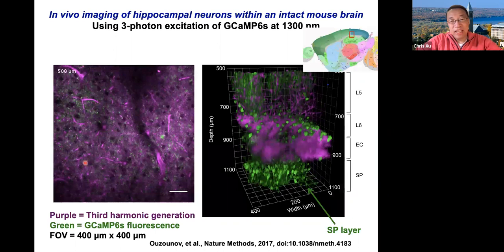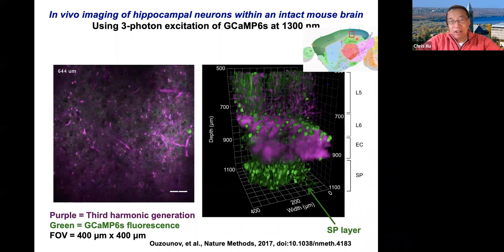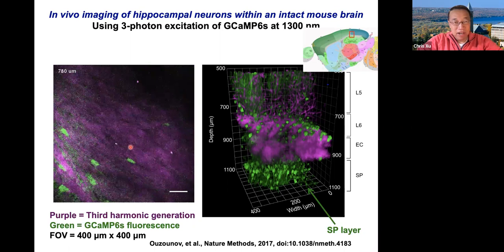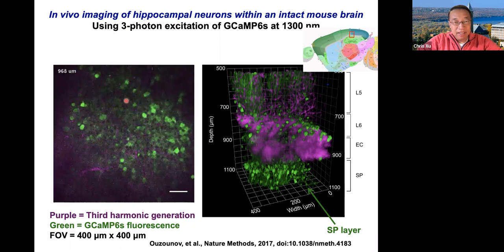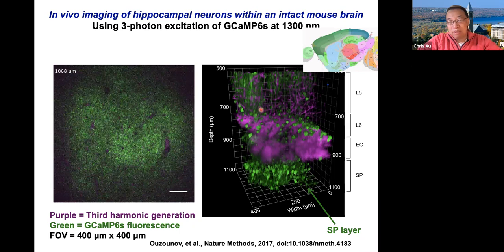Now we can do wonderful things once you can go deep with the long wavelength and three-photon approach. For example, here we image all the way through the cortical column, through the white matter, and all the way to the hippocampus of a mouse brain. You can see the white matter going by — these are third harmonic generation signals — and then you can see the SP layer in the hippocampus. This is a living, breathing, behaving mouse. This is a three-dimensional reconstruction showing neurons, with the purple being third harmonic generation of myelinated axons in the external capsule, and the hippocampal layers underneath in the subcortical region.